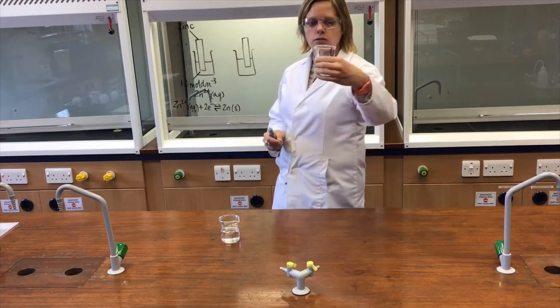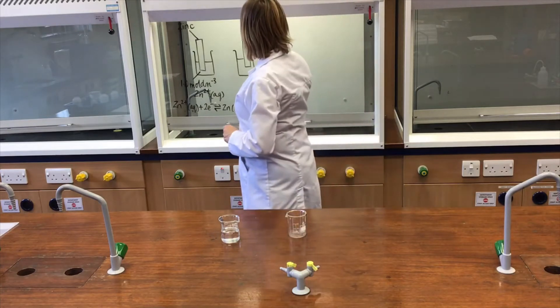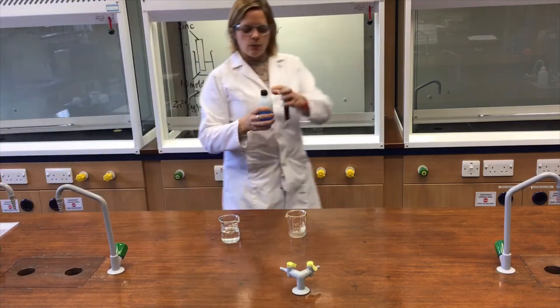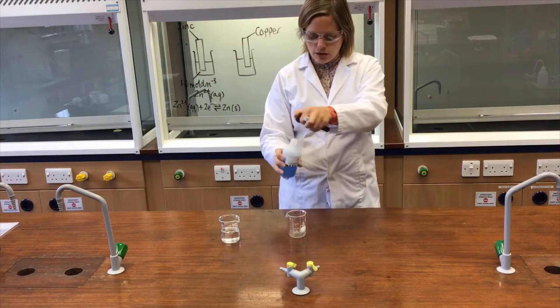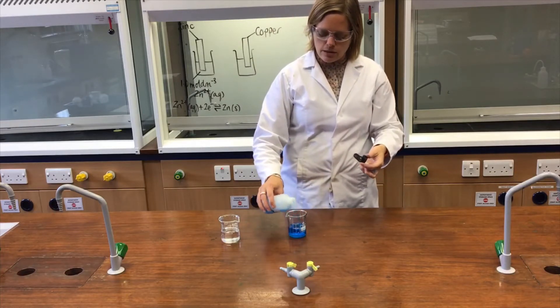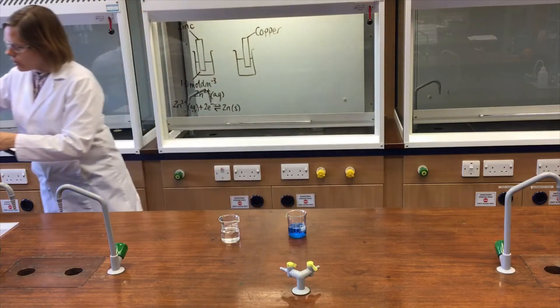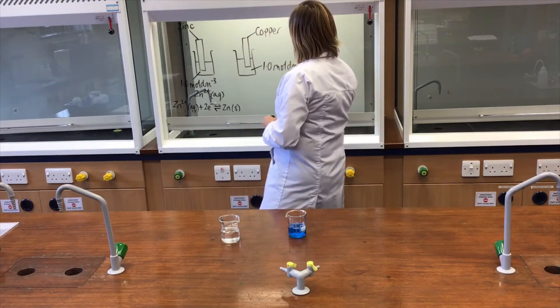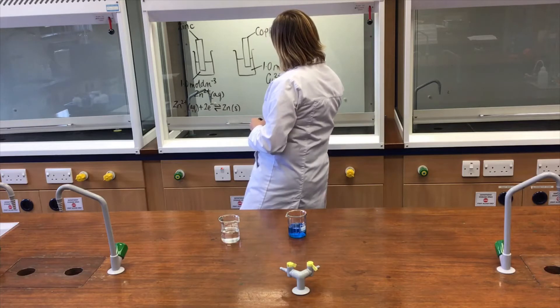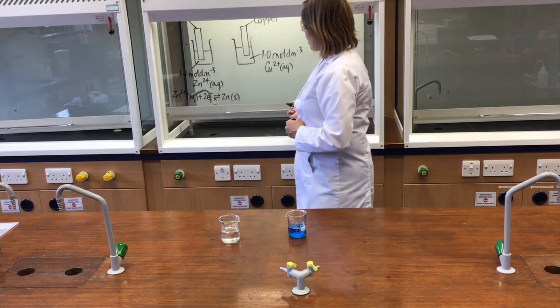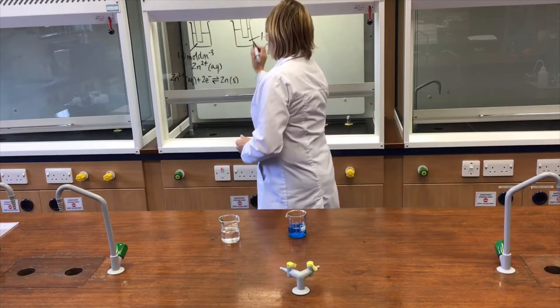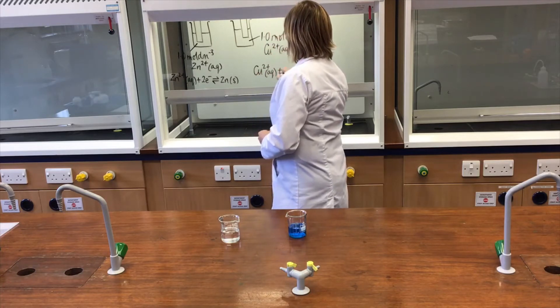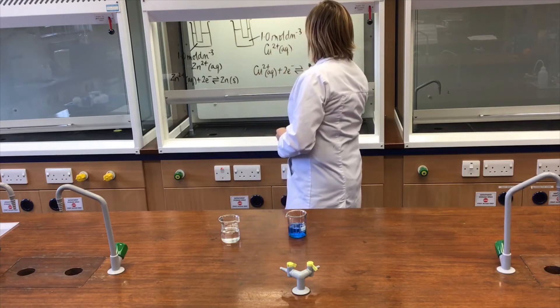In this other beaker I've got some copper metal. I'm going to add 1 mol per decimetre cubed copper(II) sulfate solution, about half a beaker full. That copper(II) sulfate solution also has a Cu²⁺ concentration of 1 mol per decimetre cubed. A similar equilibrium is set up: Cu²⁺ (aq) + 2e⁻ ⇌ Cu (s).